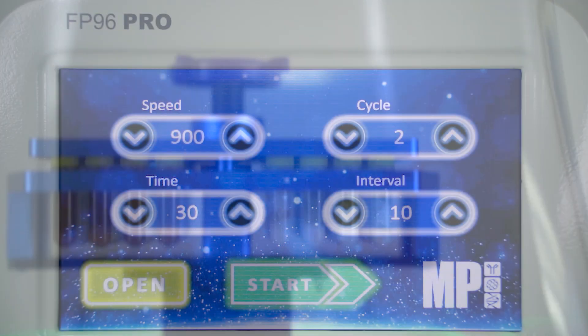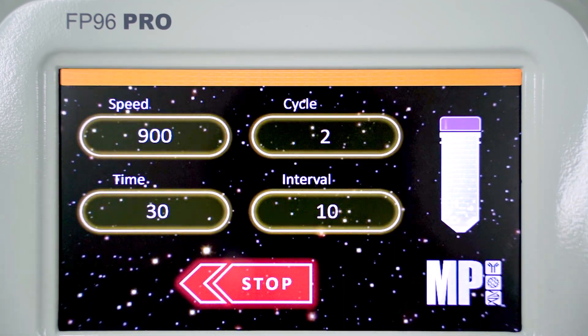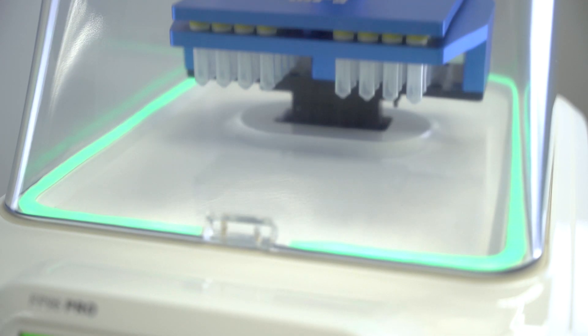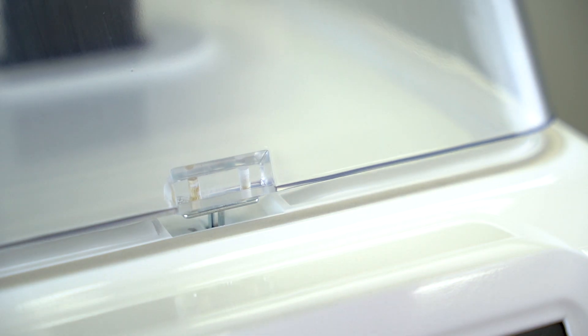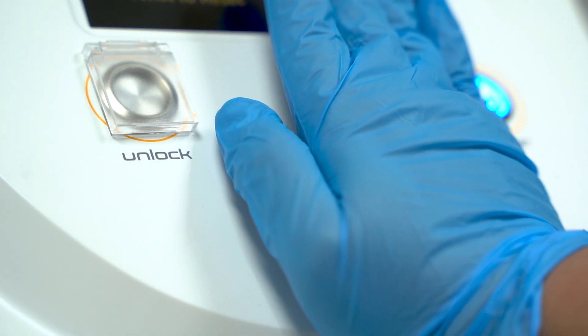With an intuitive touchscreen interface and a clear progress bar, setting up and tracking each run is smooth and straightforward. And because safety comes first, it's equipped with a secure dome lock and a quick access emergency stop button for total peace of mind.